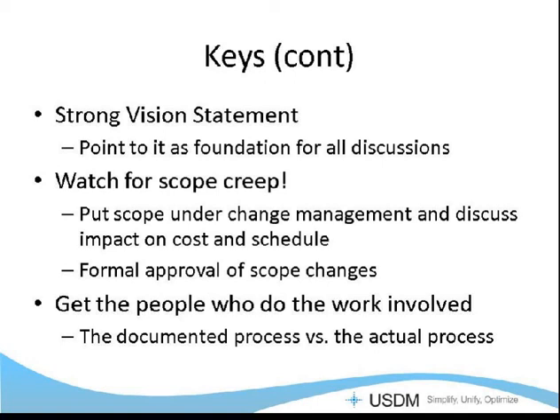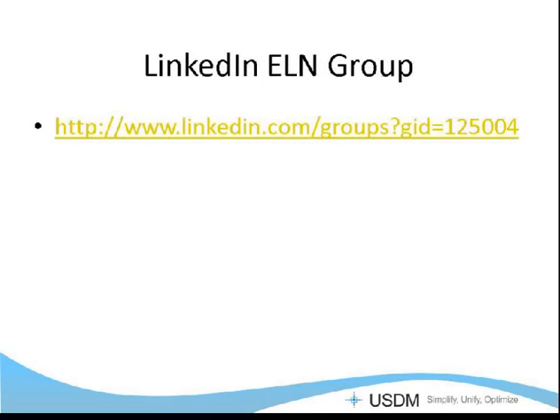Another key that I learned the hard way is that there's the documented process and there's the actual process, and they're not the same by a long shot. So I would say for two reasons, get people who actually work the process involved. Number one is because you can find out what is actually done, and number two, you can actually get them excited about making the change. And if people who are going to use the system are excited about it, then you have a greater chance of success. And that's the general overview.